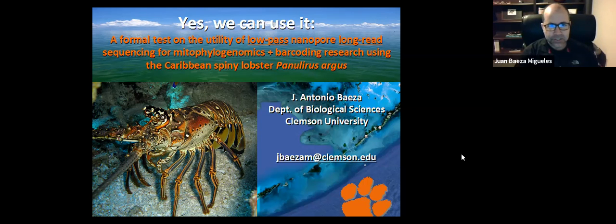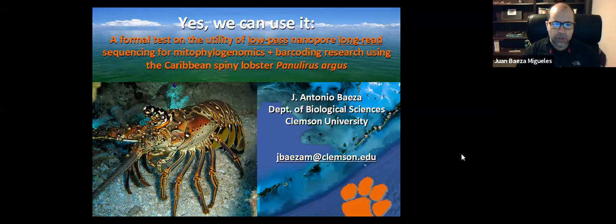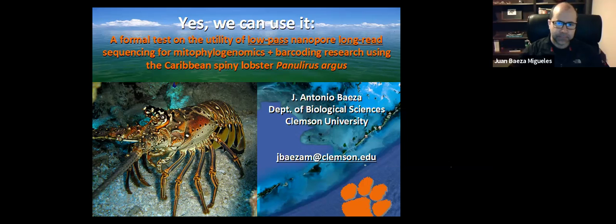In this talk, I want to give you some information about testing the utility of low-pass nanopore long-read sequencing for mitophylogenomics and barcoding research using the Caribbean spiny lobster Panulirus argus as a model system.